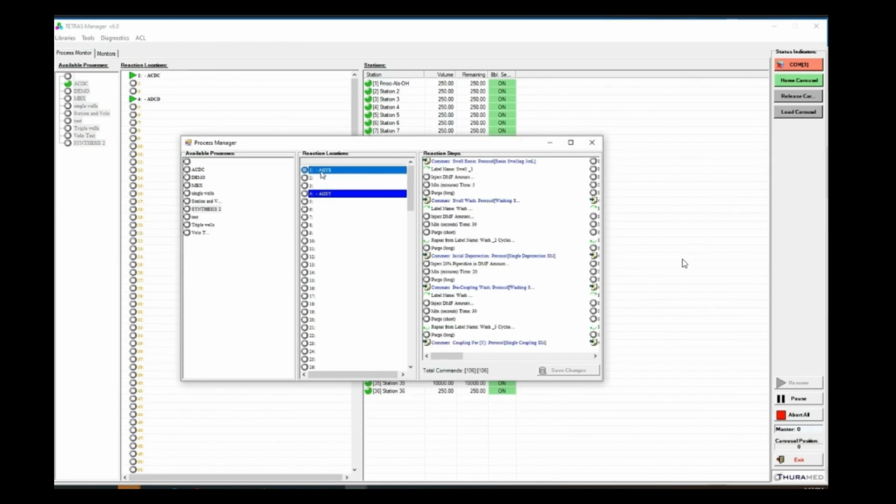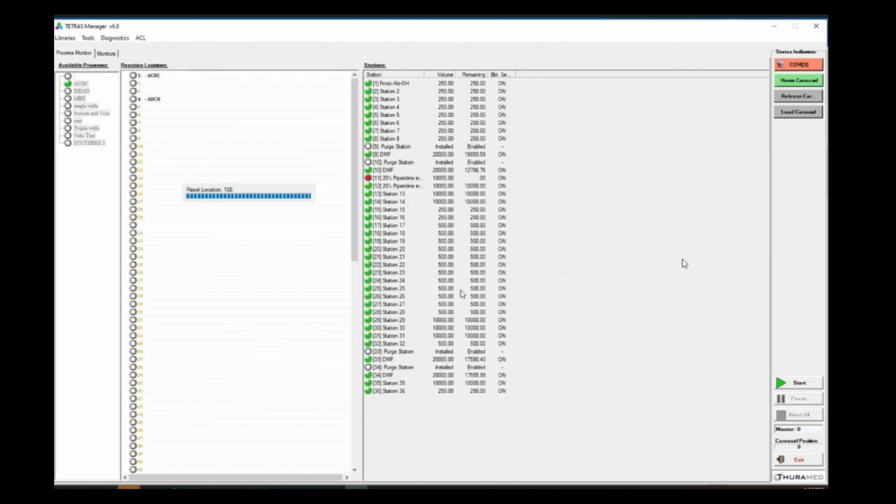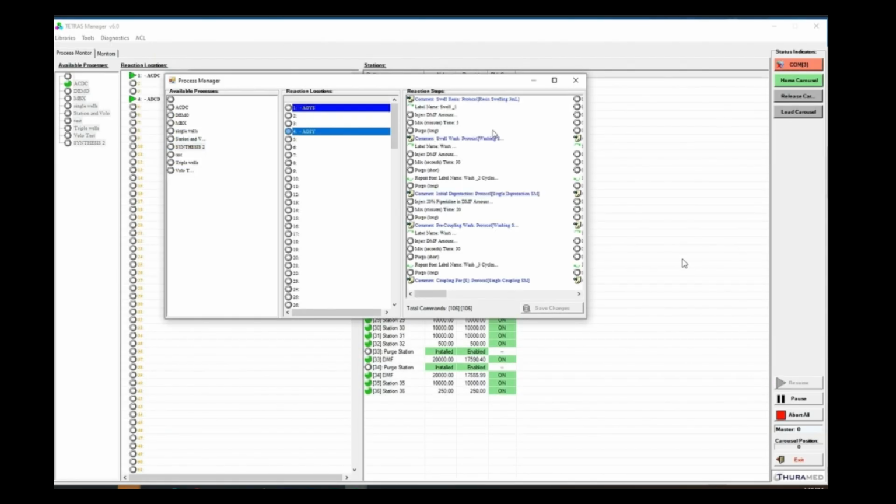So I can, just like before, go to the Peptide wizard to edit all these, or I can leave them as is. For this example, I'm just going to leave them as is so that we don't double what we did. After that, we have decided to leave this as is, we will go ahead and close this.